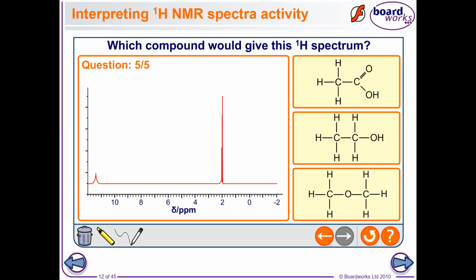It's quite a long way away. I mean, what is that, about 8, 10, that's probably 11 point something units. That's probably about as big a chemical shift as a proton NMR will ever give. So that hydrogen there must be pretty well de-shielded from the magnetic field. Okay, well, we've seen the OH one earlier. It wasn't as far down as that, but look at that hydrogen. Sorry, I should be talking just about different environments, but think about the fact that that hydrogen there is attached to an oxygen, and right next door is a carbon oxygen, which will also draw electrons away from it. So that hydrogen there is very well unprotected, if you like, de-shielded by the magnetic field. Incidentally, all we had to say was there's two different environments, and there's your answer there.